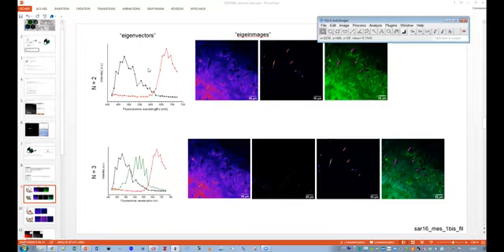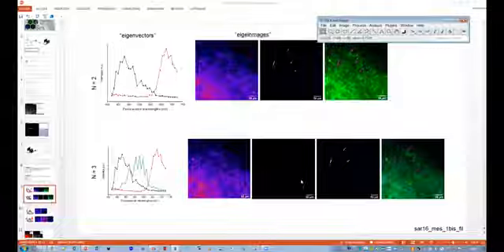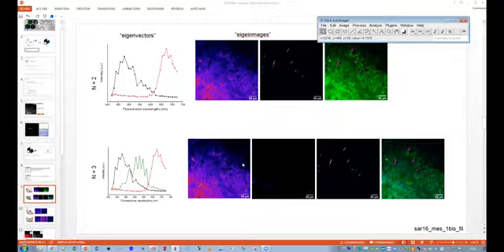For instance, here I have two components, here 3 components. And after I said to myself, maybe the second component is not relevant enough because it may be part of the first component. But the other thing I'm doing is that I want to extract the fluorescence spectrum and to compare them. That I'm going to show you after. Is that okay? Yes.